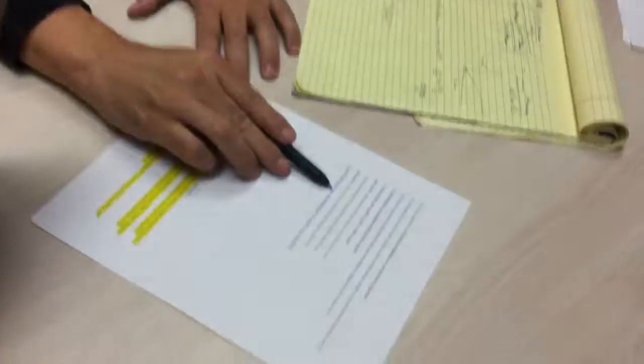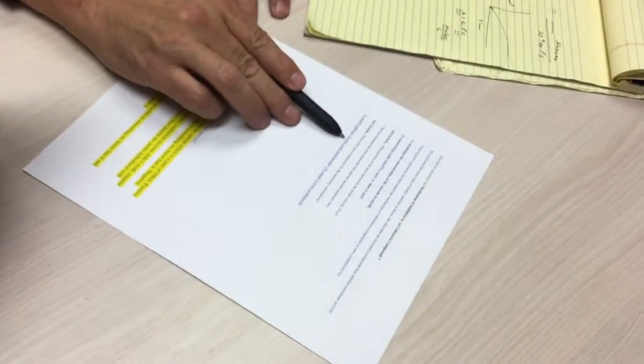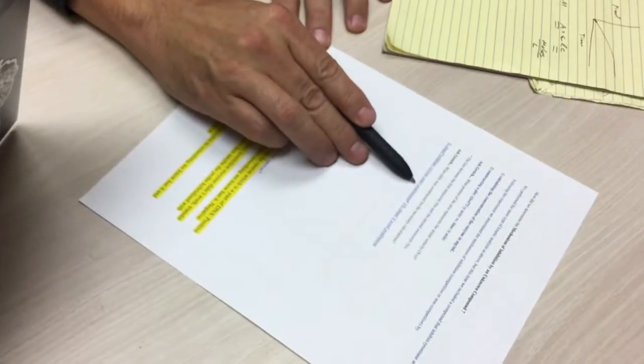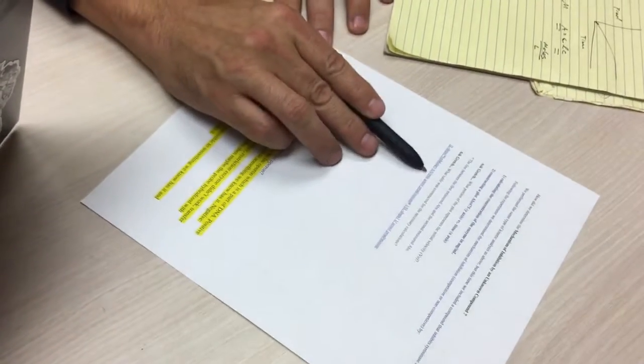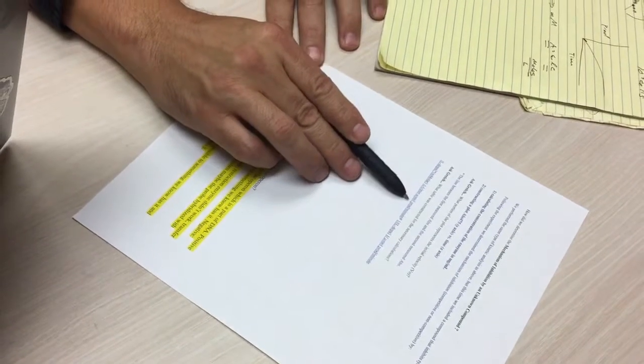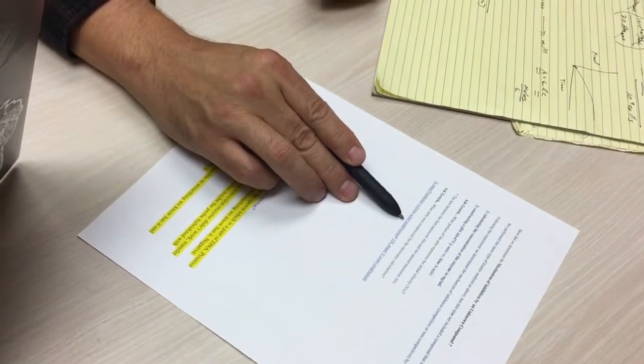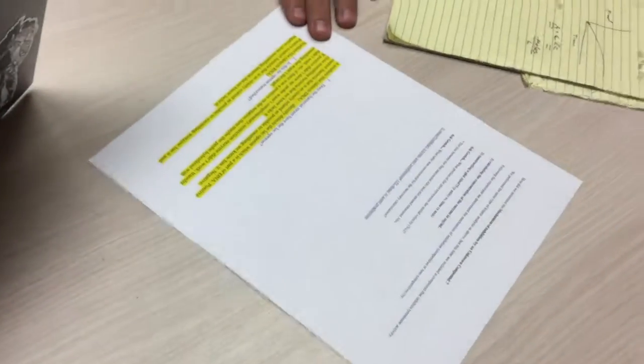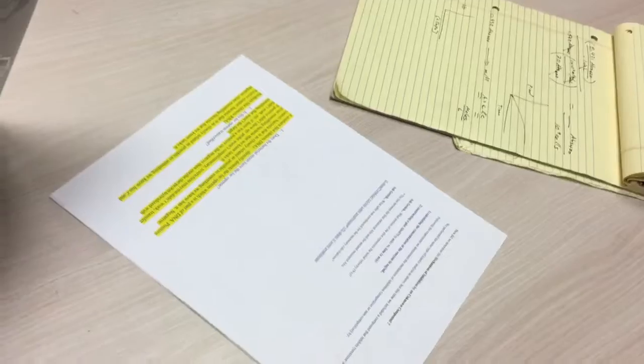Here, you're taking your measured change in absorbance and using Beer's law to convert it into an amount of product. Right? So you first convert it into moles per liter, and then you convert that to micromoles per liter, and then you multiply that by the number of liters, and you have micromoles. So once you have this column and you have this column, you can generate a graph.